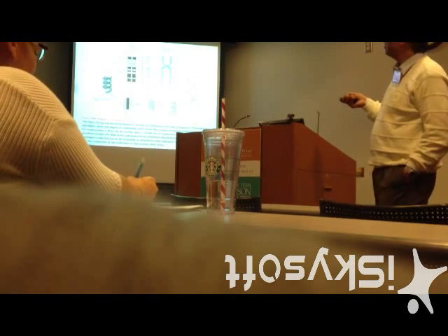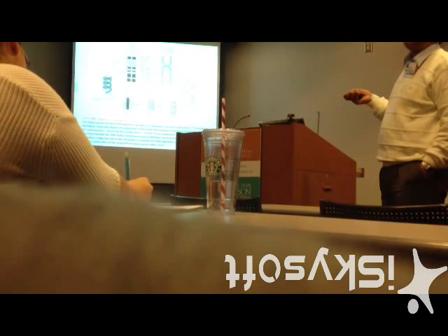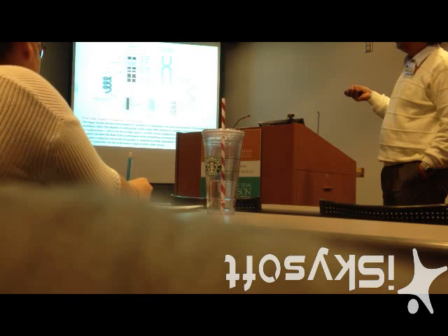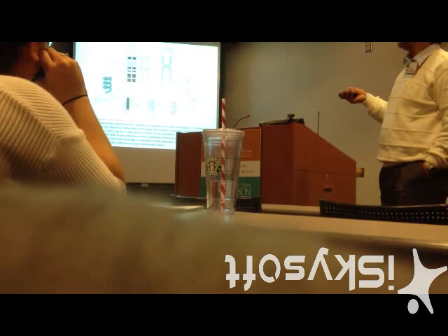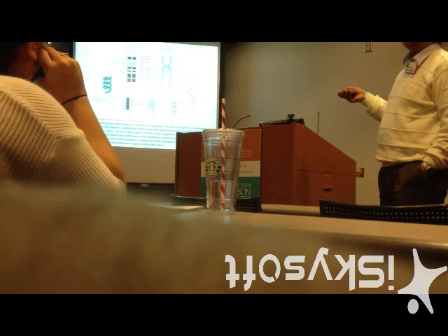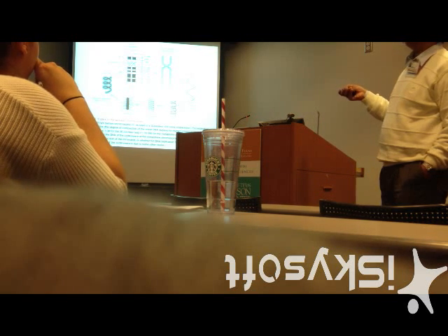So typically, if we want to say where a chromosome may be broken or translocated, we can refer to a discrete unit, based on the staining pattern, and say this is where the chromosome has been broken or was translocated. For example, this segment here will be called P211, okay? Similarly, on this side, it will be called Q12. This will be Q211, and this will be P12.